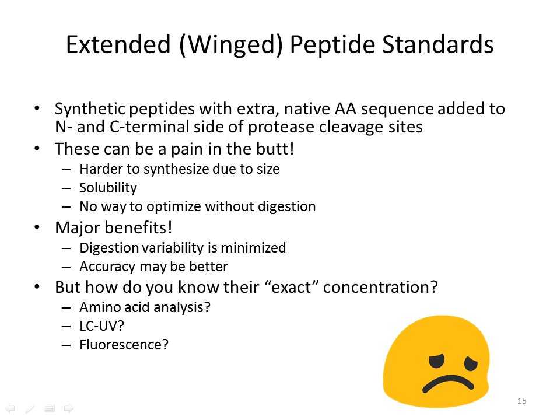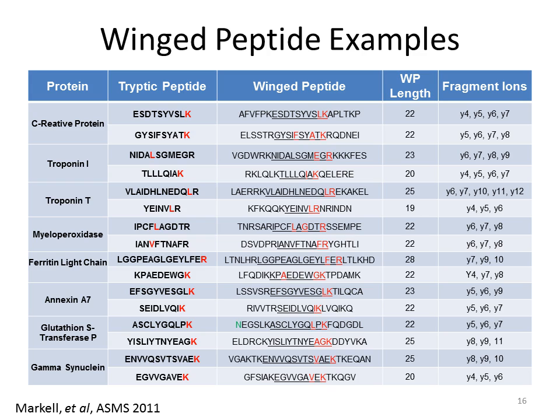I had always hoped, because amino acids can absorb and can potentially fluoresce if certain amino acids are present, that vendors would make heavy labeled peptides with acid cleavable tags or protease cleavable tags, where you would know how much is in there by doing a UV measurement on a NanoDrop or something. You would use like a microliter of your stock. It would be so awesome, but we're not there yet. But if you keep asking Pierce and Fisher and whoever else, maybe they will make it.